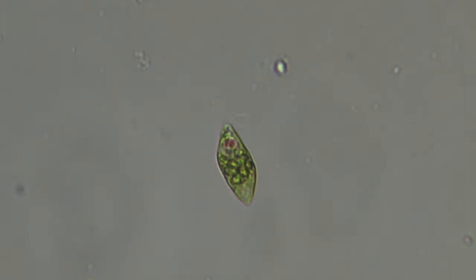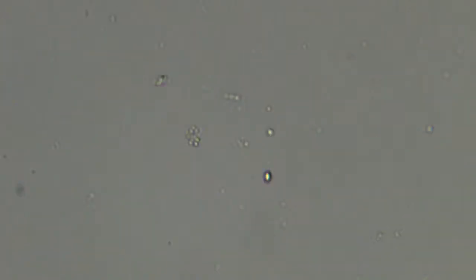Nice view of the chloroplast in there. Again, animal chloroplast. That's a real anomaly. There are some Euglena without chloroplast that are just heterotrophs. Autotrophs make their own food, like plants and algae and these guys. And then there's some euglenoids that actually don't have chlorophyll and just capture food like all the other guys you've seen, making food vacuoles.